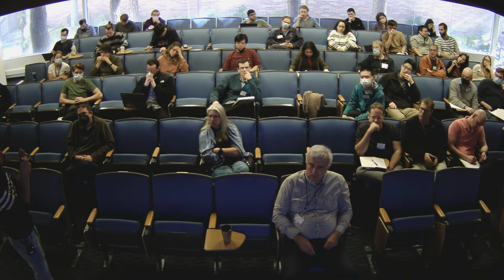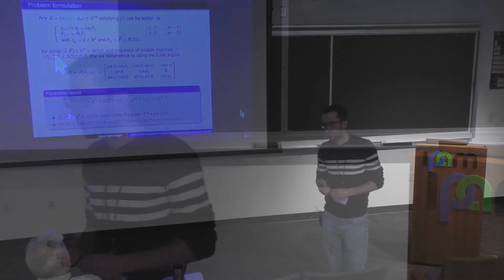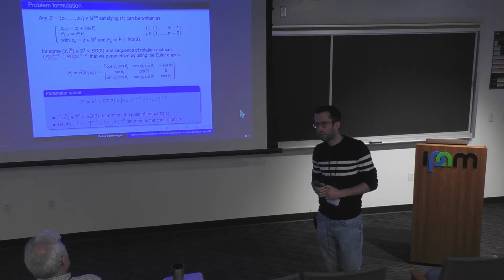I know that it can vary, but it's more or less constant, right? The distance between C alpha positions is usually more or less constant. It's of the order of 4 angstroms or something like that. To me, this looks pretty much like a model from robotics.